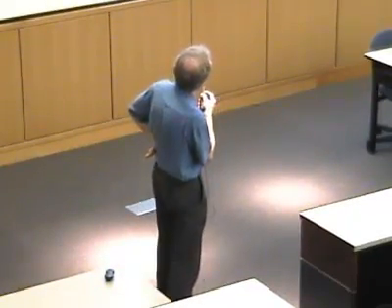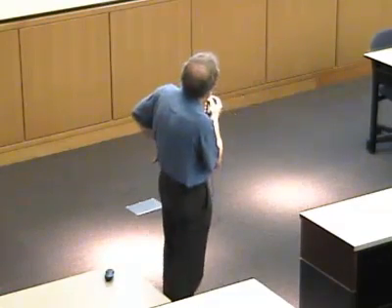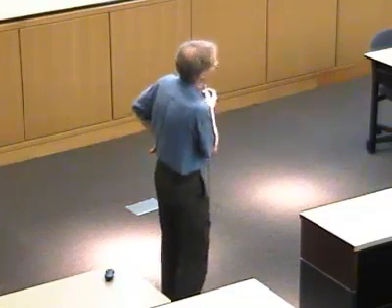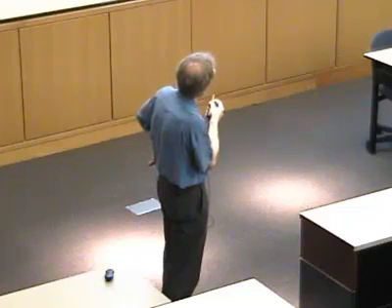Okay. So here's what the data looks like in kind of cartoon form. That's a good way to start out looking at it. So we add an injection. Okay, it reacts, exothermic in this case, goes back to our baseline, and we've added a small amount, and now we're ready to add another aliquot, and we keep doing this, so it's a simple titration.